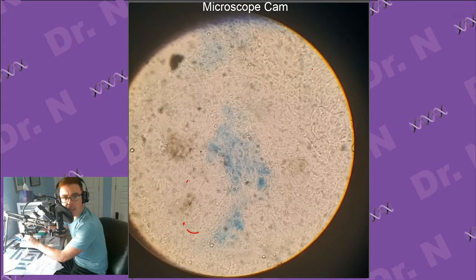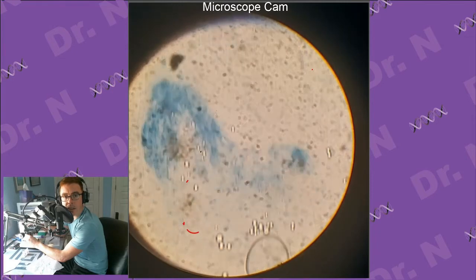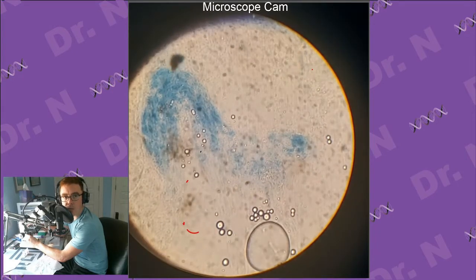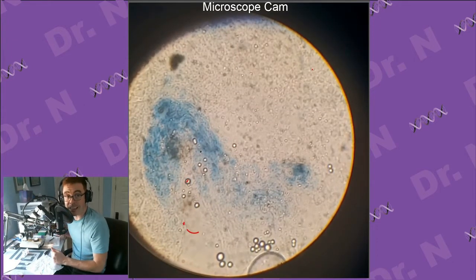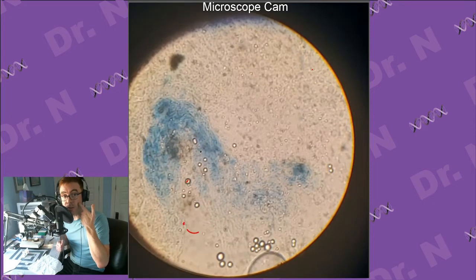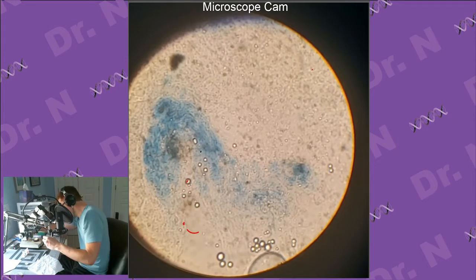The salivary glands and the other tissues in this area of the larva are usually covered in fat. So I think, yeah, that's just fat tissue. I can tell because they're smaller cells. So there's a bunch of cells right there. We can actually see better cells if I just take some from the inside of my mouth, because humans just have bigger cells than larvae of fruit flies.